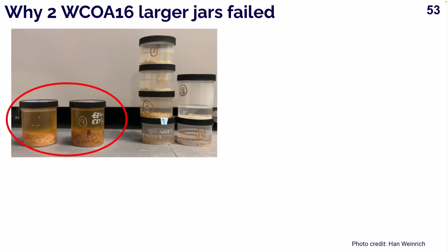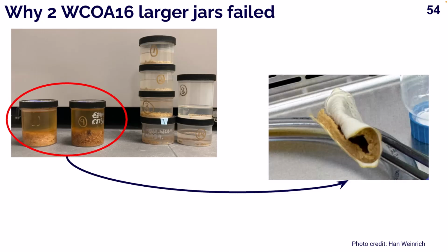Just from looking at it dead on, we can see that there was not proper preservation of these samples, and it looks like the different things decomposed within it, and definitely did not have preservation of that DNA. And even when we filtered it, it left just a sludge of decomposed animals on the filter, which we lovingly call the bean burrito.